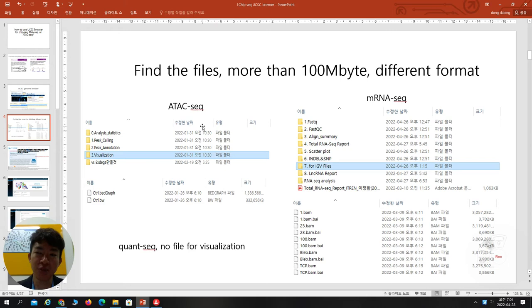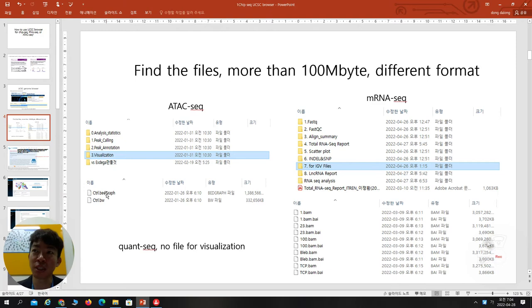When you cannot find which file can be uploaded, most files are more than 100 MB. Depending on the company, they use different formats — sometimes BAM, sometimes BigWig, bedGraph. So if you're not sure, just upload everything and see which one is available.